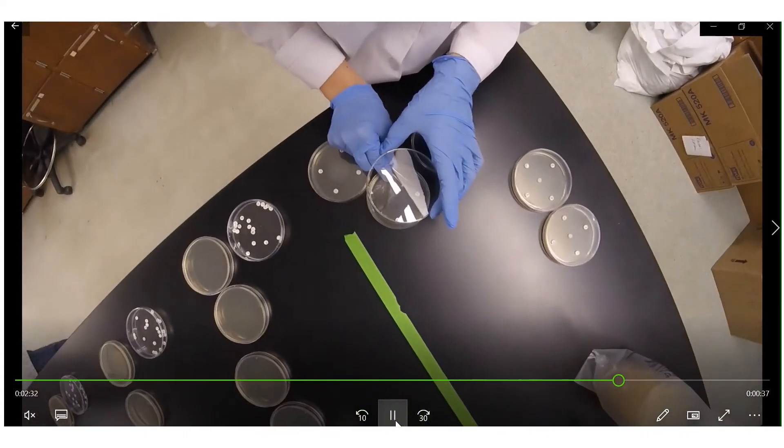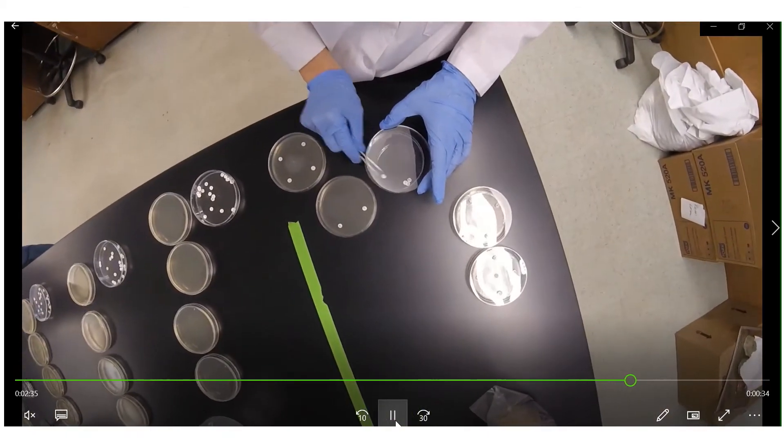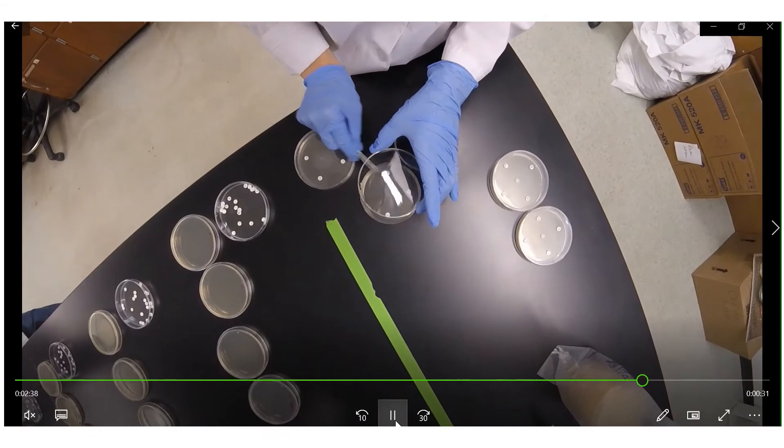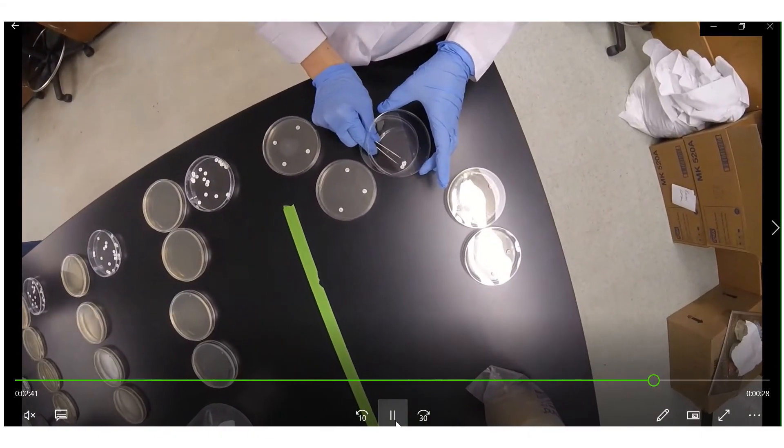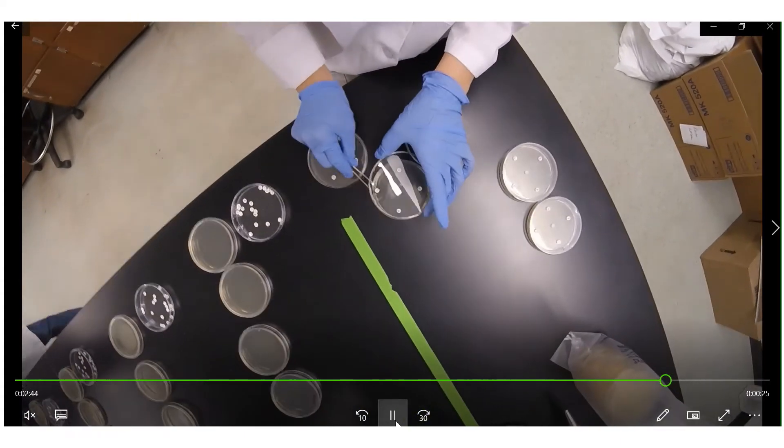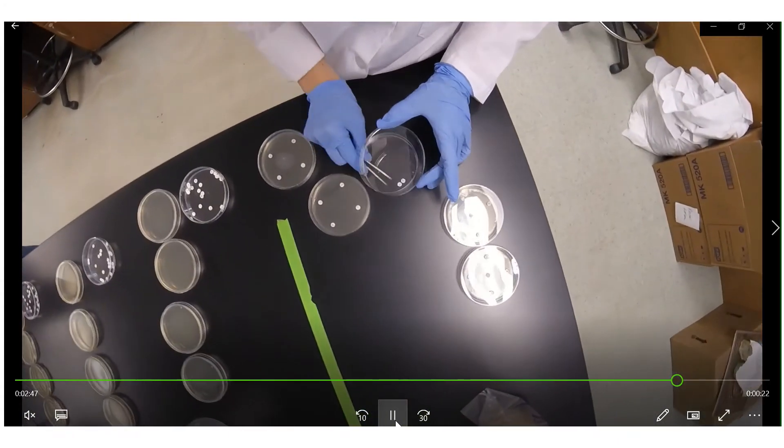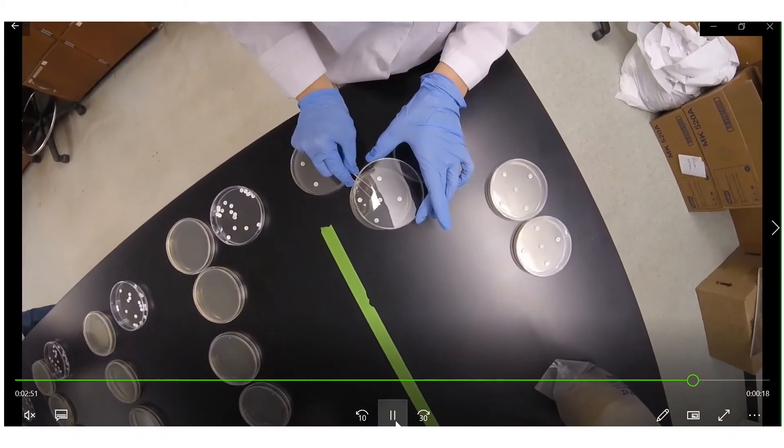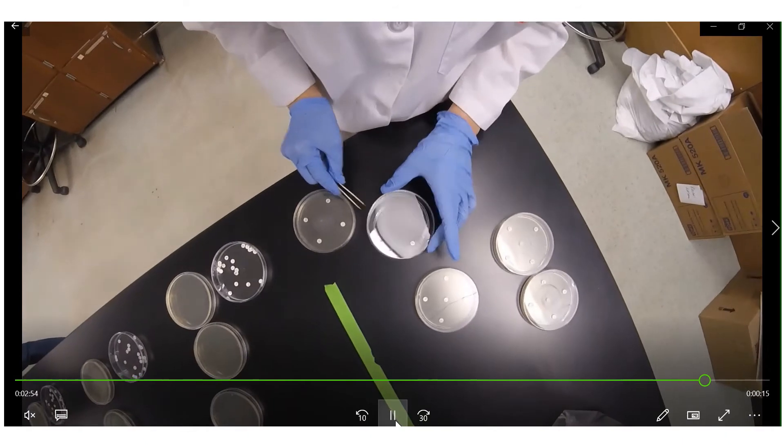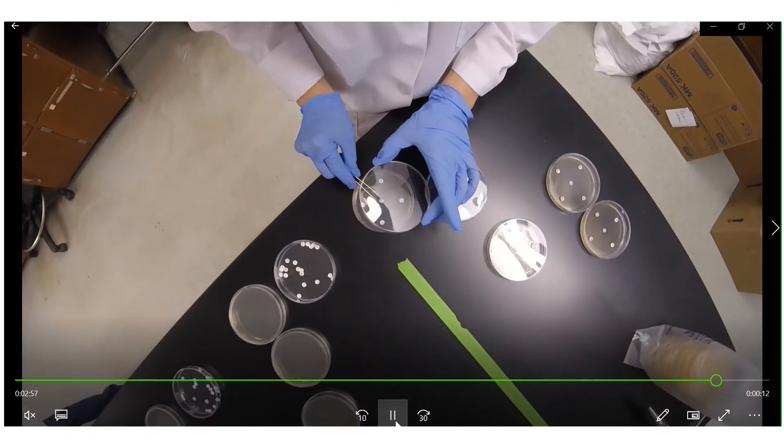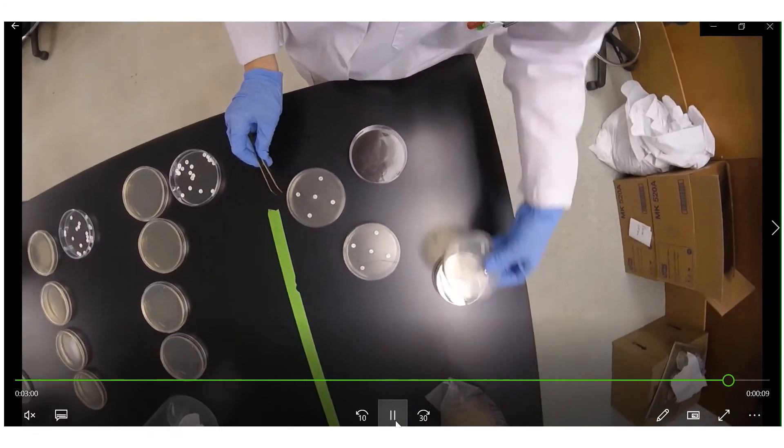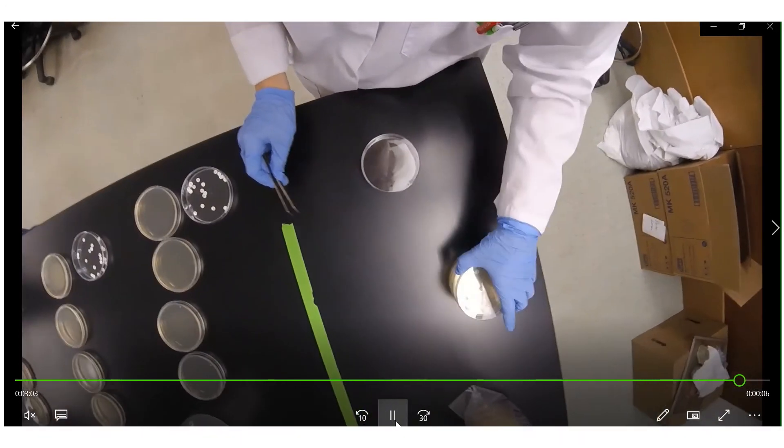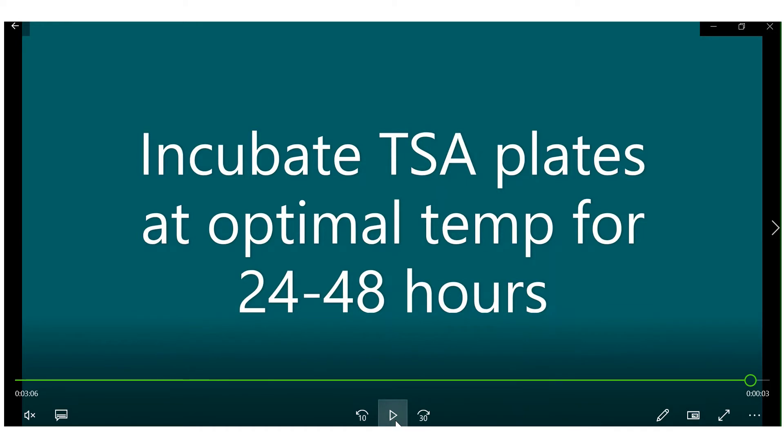And here I am applying the antibiotic discs in a five-sided die formation. So that means that there are five discs per plate and I'm trying to spread them out apart from each other. This will come in of importance later when we're analyzing our plates but pretty much this formation makes it so I'm not grouping them too close so the zone of inhibitions are distinguishable from each other. Once that's done you're going to stack your plates and then you put them in the incubator at the optimal temperature that you have previously determined for 24 to 48 hours.